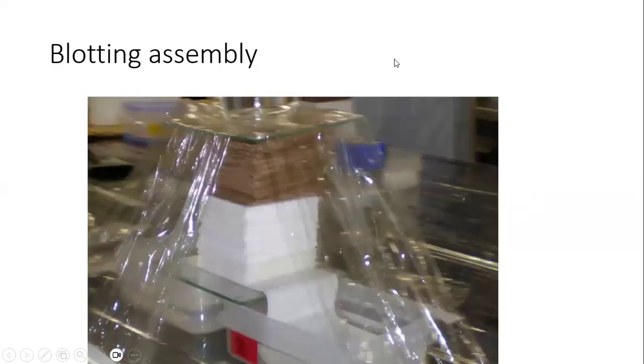So here we have the assembly which is used for blotting or transferring the DNA fragments from the gel onto a membrane. The commonly used membranes include a nylon or a nitrocellulose membrane. So this is your setup. At the base, you have a glass plate. On top of the glass plate is present a filter paper wick, which is dipped in these beakers or vessels that contain buffer. So on either side, they are dipped in the transfer buffer.